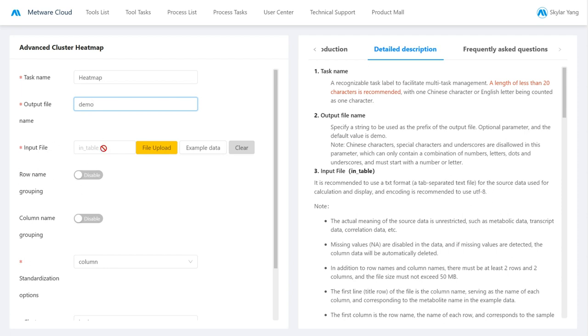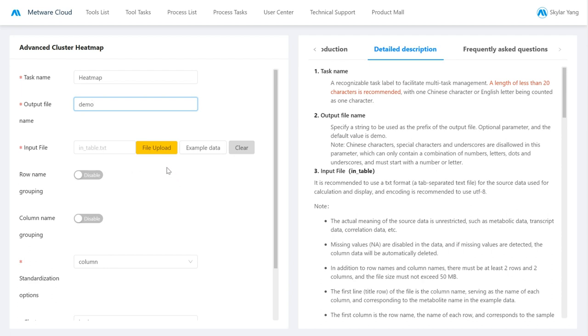And then we have the input file where you can just input your data. And you can also select the example data. That is what I will do now. So this input file should be in the TXT extension, and it's recommended that you use encoding UTF-8.